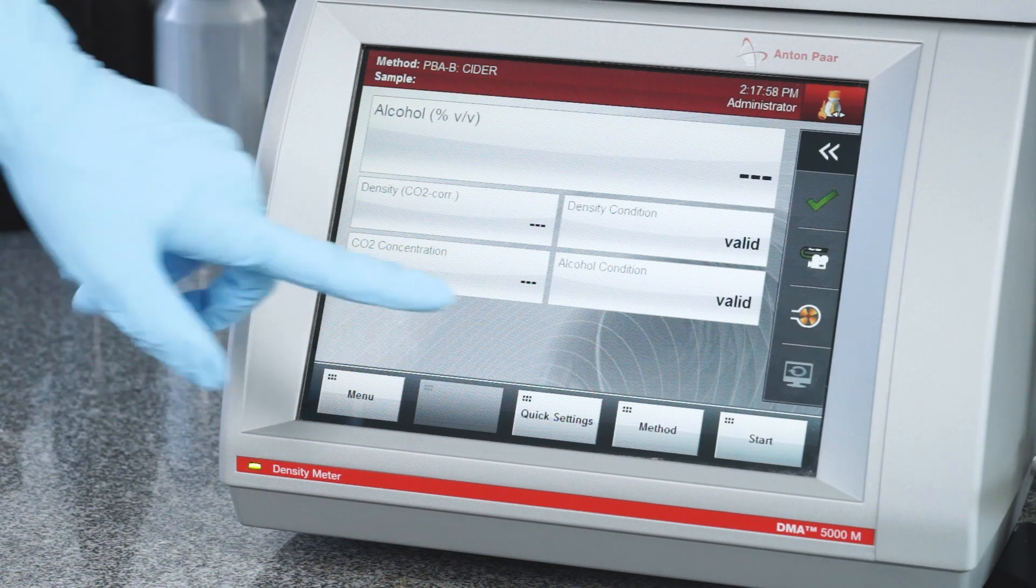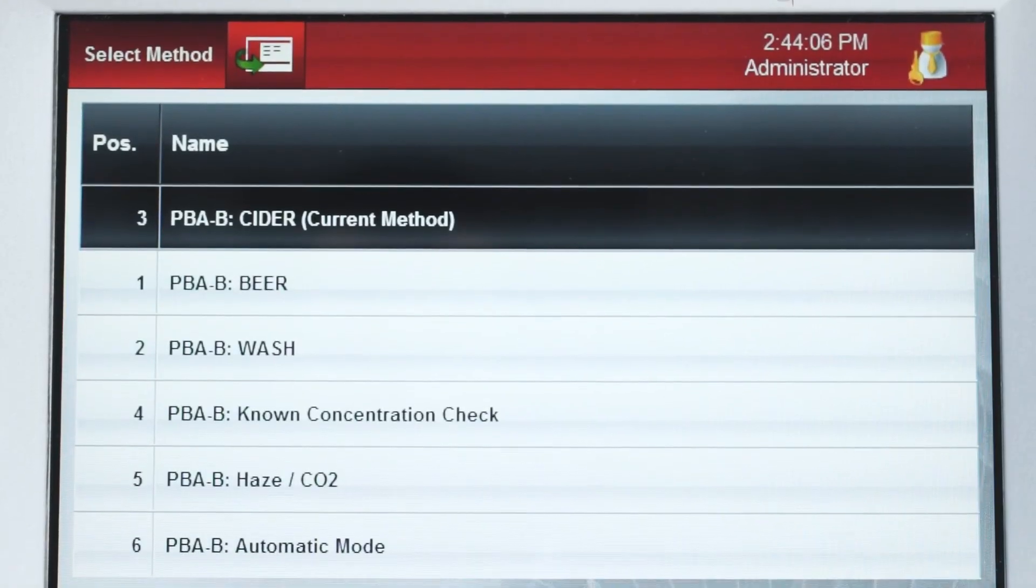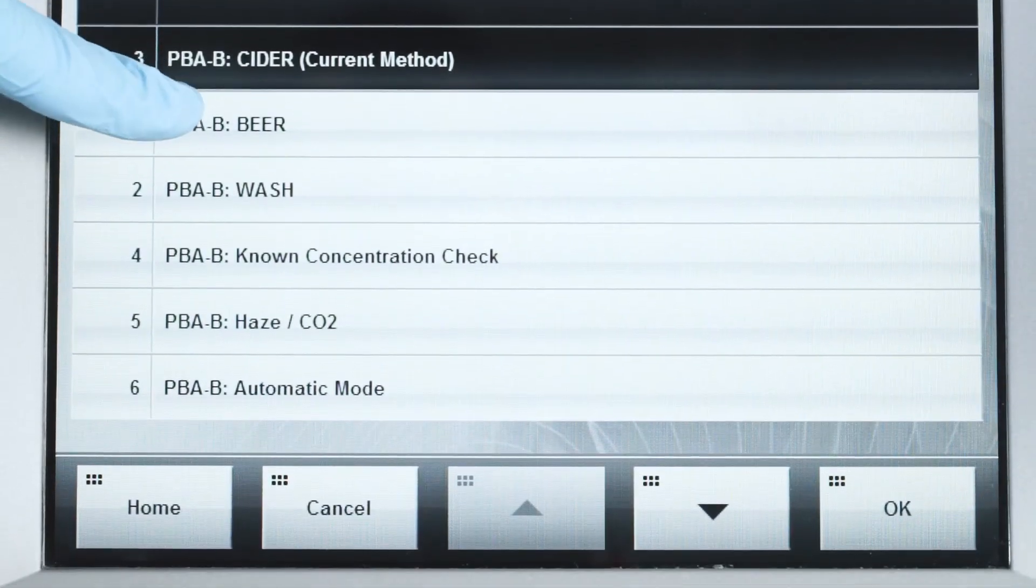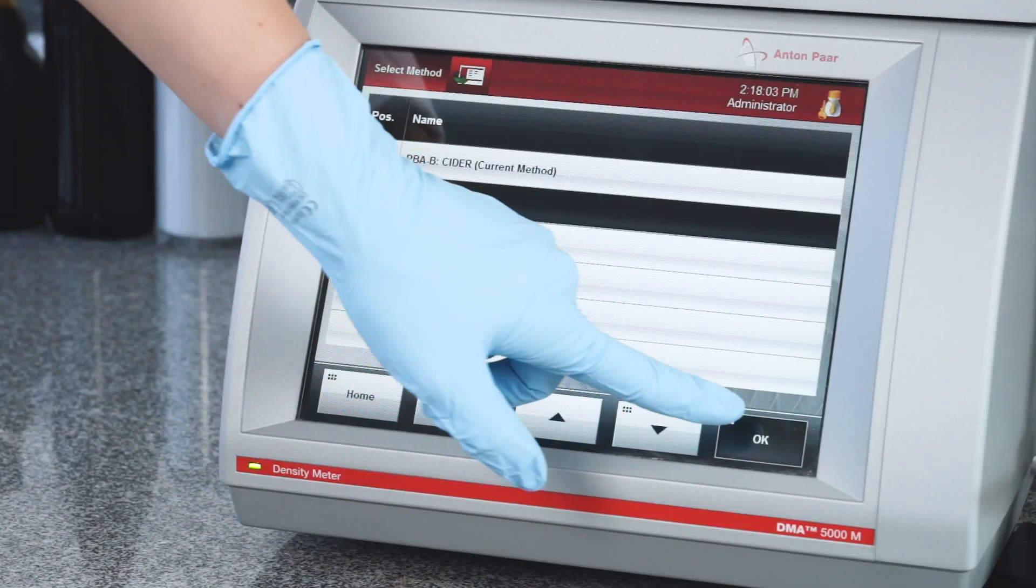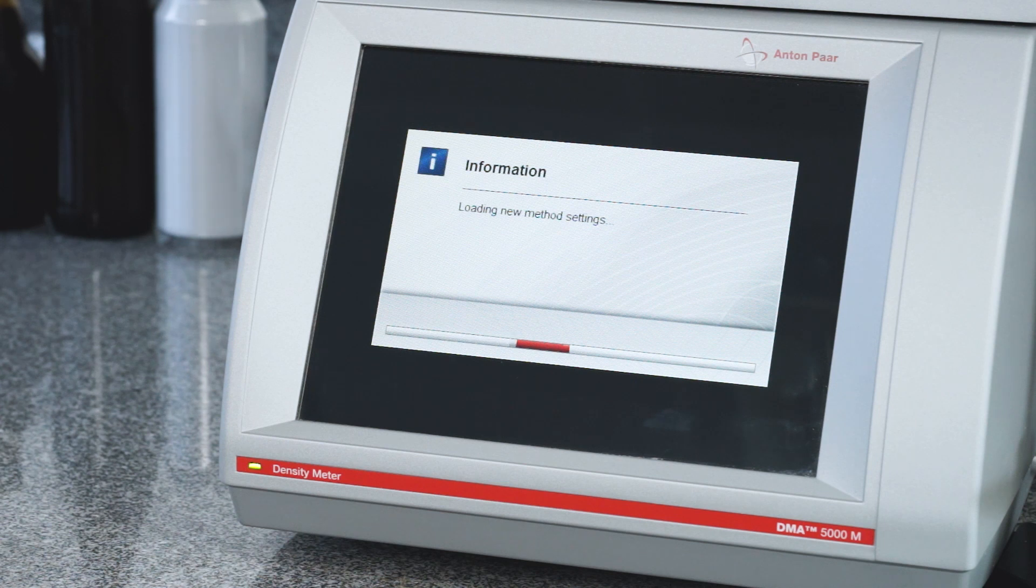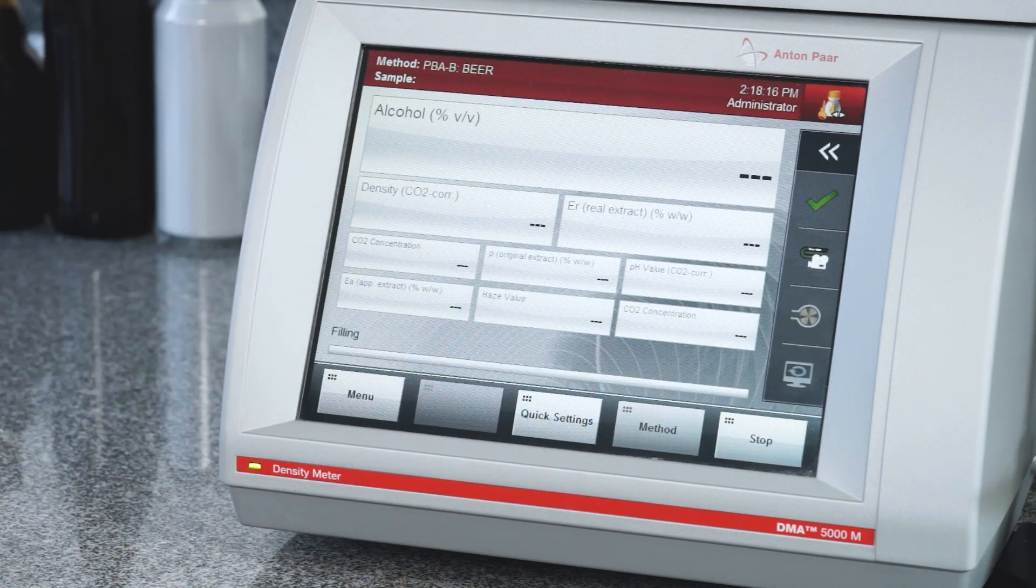The sample is prepared for the transfer. Now select the appropriate method depending on the sample type which is going to be measured. Once the method is selected, you are ready to start the measurement cycle.